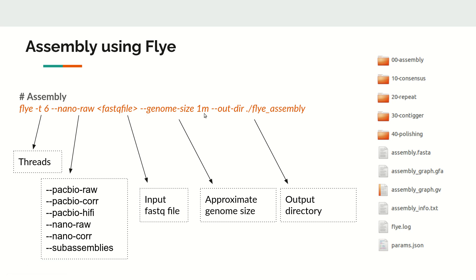Then we have to give the genome size parameter, which is the approximate genome size. This is optional but if you know the genome size, you can provide it. In this example, one million is sufficient, so we're giving one million here.